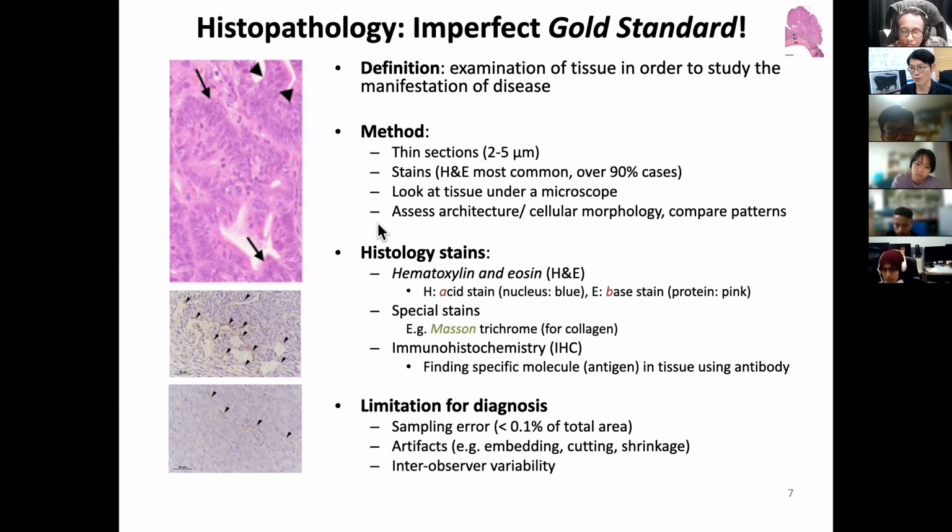And the other thing I want to emphasize is histology stains. Without contrast, we cannot see and analyze anything. A typical one, this pinkish one, is called H&E, more precisely hematoxylin and eosin. And I realized I made this opposite in previous lectures, okay? Because hematoxylin stains the nucleus, which is an acid.